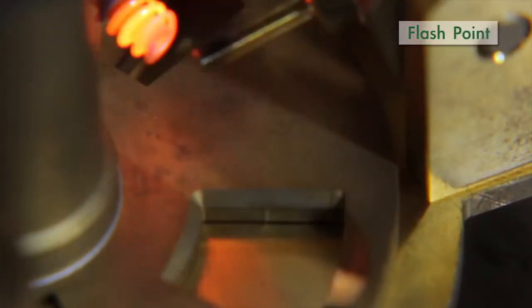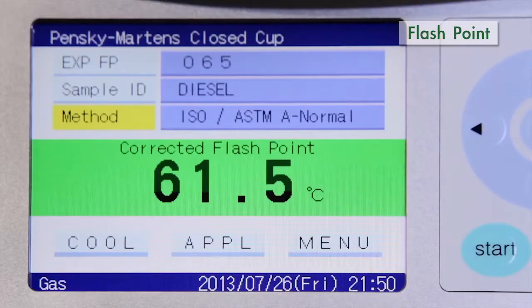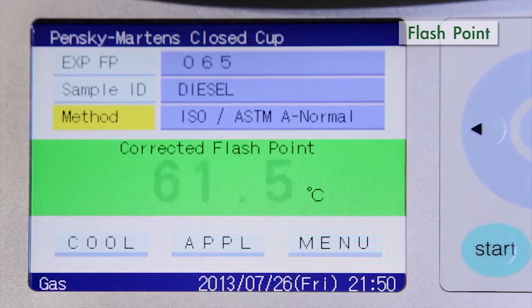Once flash is detected, the ignition source automatically shuts off with the corrected flashpoint displayed on the screen against a green background.